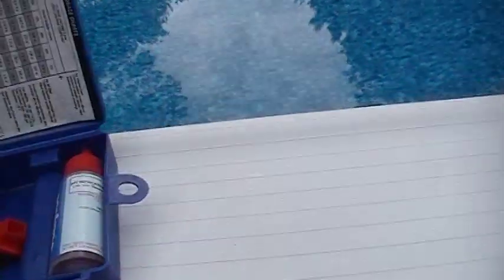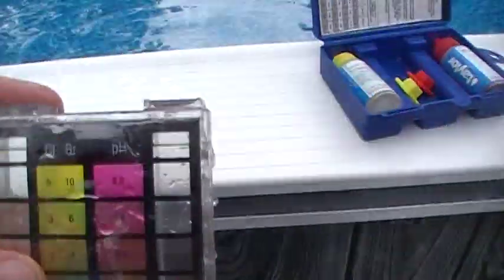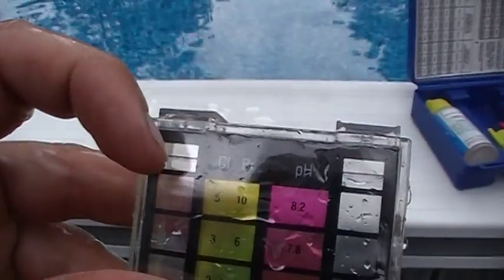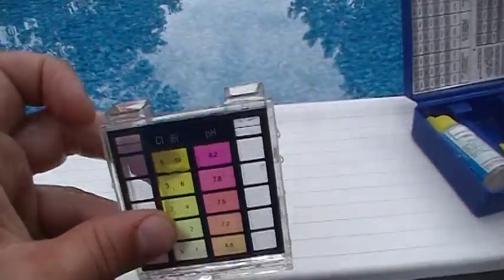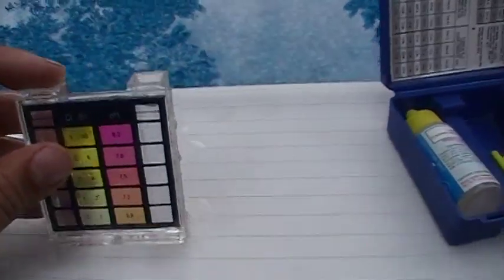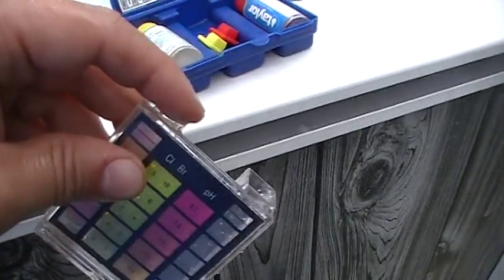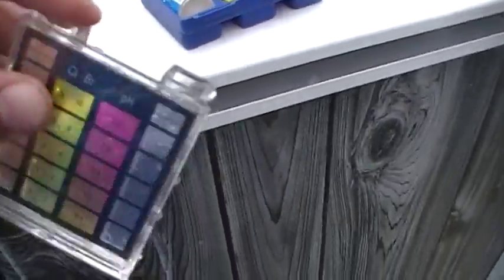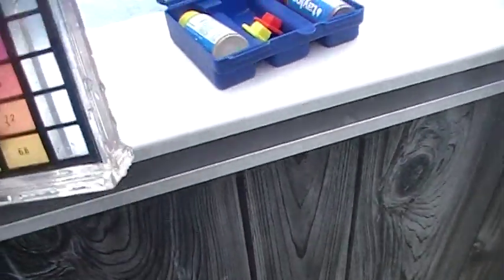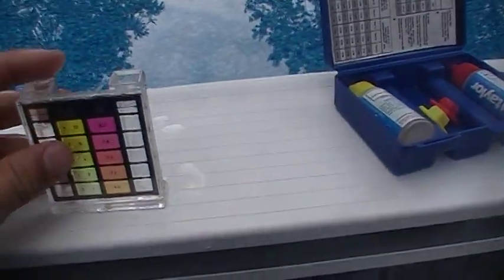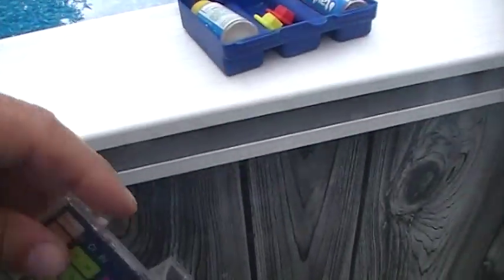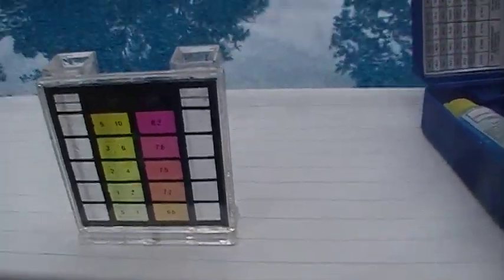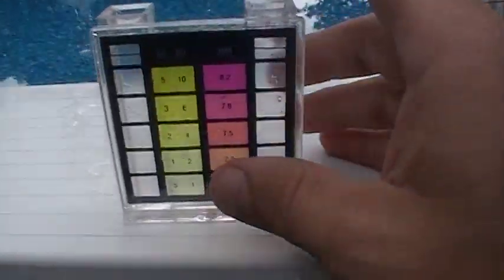The first thing you do is scoop up some water in the little vial from your pool. Right where these lines are, you're going to want the water level to be at exactly those lines. So you just empty a little bit out at a time until the water level is right at those lines.